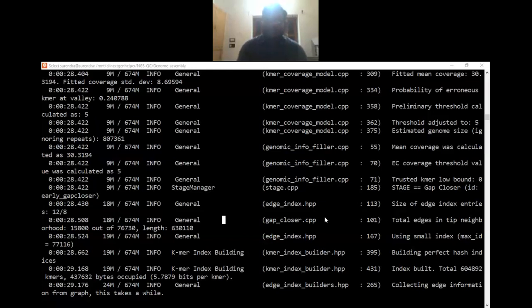Another thing you can do is design primers and then go for the gaps, but that will cost you a lot of time. Yes, that will be very lengthy. So the only thing is that we have to perform both long reads as well as short reads for better depth, and then perform assembly combining all those reads. Nowadays, this is the best approach, I would say. Okay, thank you.